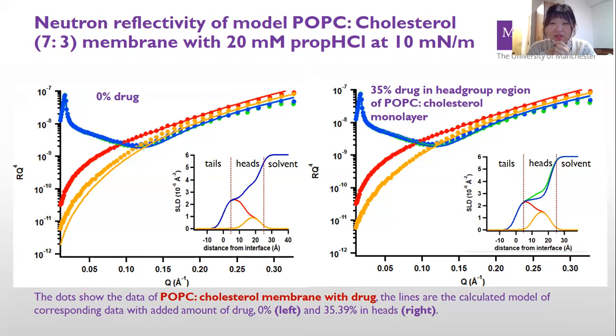And because these data were obtained after the interaction, we also applied kinetic neutron reflectometry to resolve what is happening during the interaction. And we also plan to do some Brewster angle microscopy, which is an imaging technique to obtain the lateral morphology on the micrometer scale.